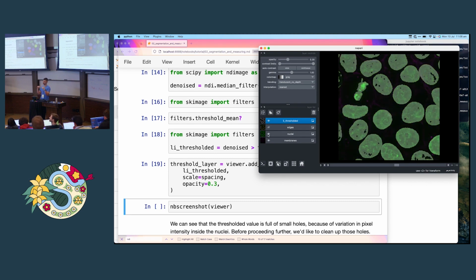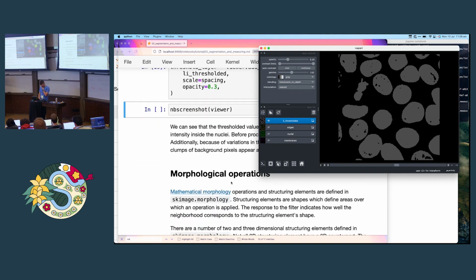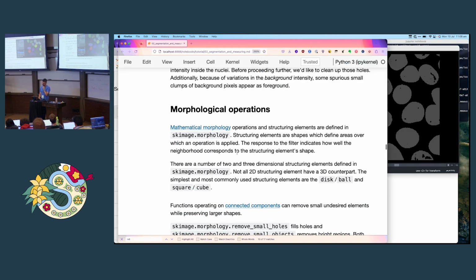And it does this by using the image intensity as a bit of a landscape into which to flood. So wherever you find edges in your edges image, the watershed will tend to stop at those edges as if there were mountains in the landscape. And this translates to 3D quite well, actually. So that's what we're going to do. We're going to try to place some markers at the center of each of these nuclei, and then we're going to run a watershed from those markers.